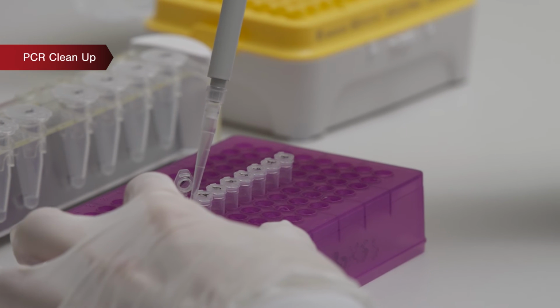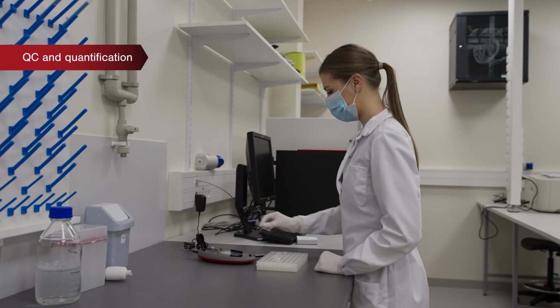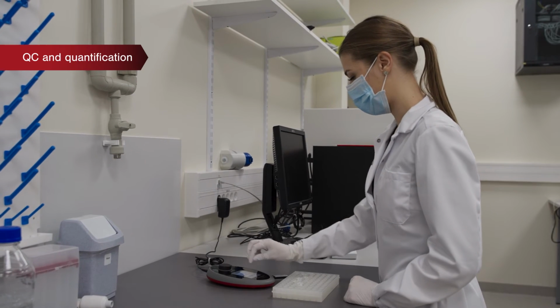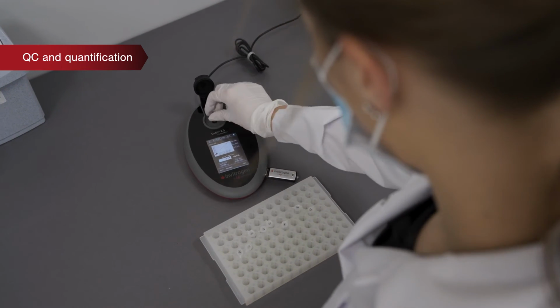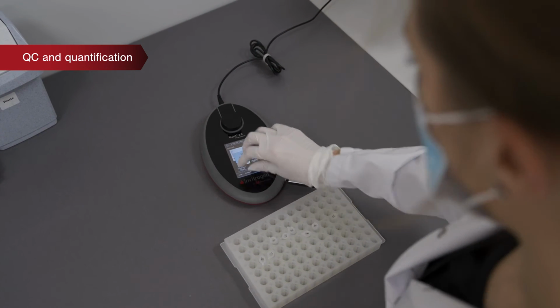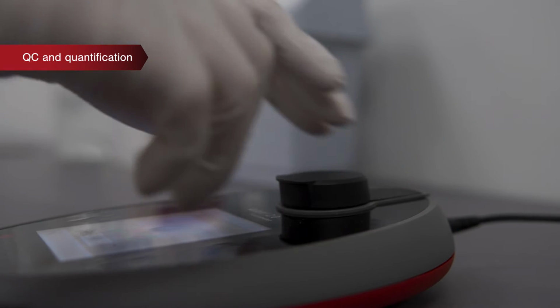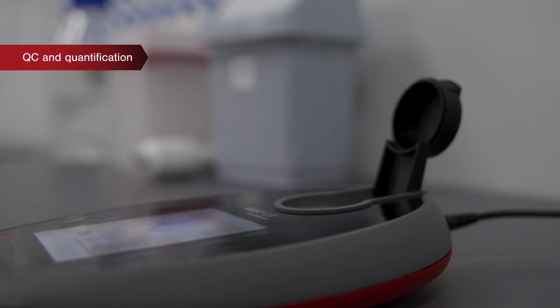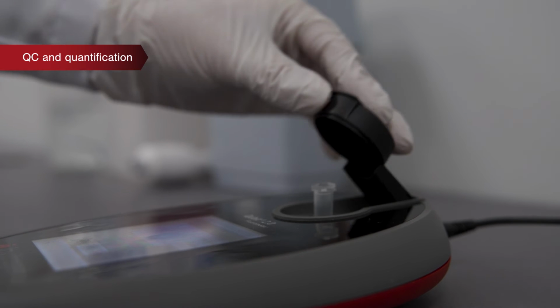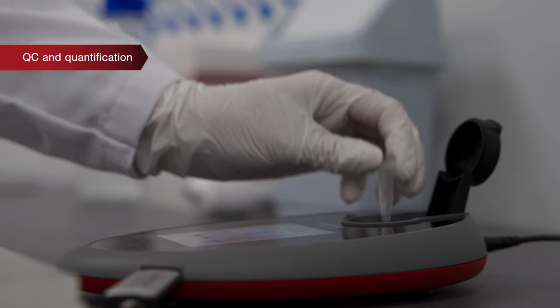After the bead-based purification of the PCR product, the concentration is measured with a Qubit fluorometer and a high-sensitivity double-stranded DNA assay kit. The required yield for PCR products is greater than or equal to 1 picomole per lane. The concentration of the target molecule in the analyzed sample is determined by means of a fluorometer compared to a known concentration in the standards. The method is based on fluorescence emission. The fluorescent dye emits light only after binding to the target molecule, which in this case is DNA.